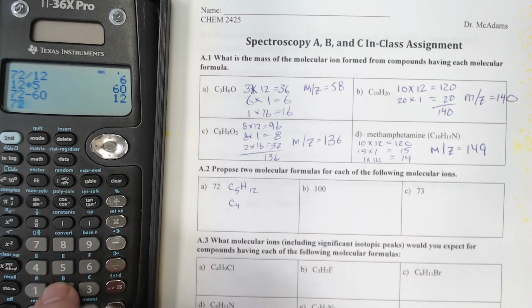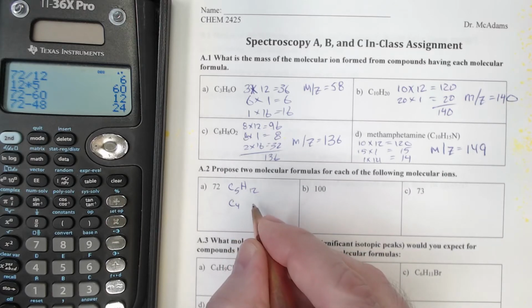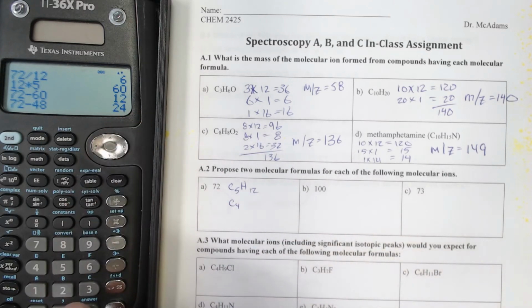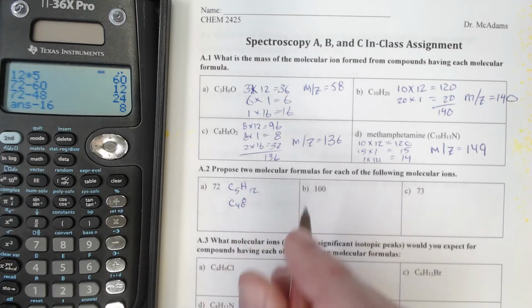We'll do 72 minus 48, and that gives us 24. We can't put 24 hydrogens on 4 carbons. That's just not going to work. But we could put an oxygen in there, and oxygen is 16. So I'm going to subtract 16, and that gives us 8. So we could have a molecule C4H8.